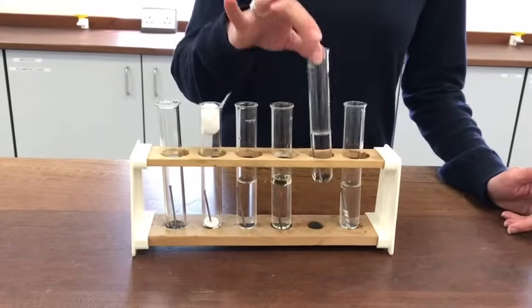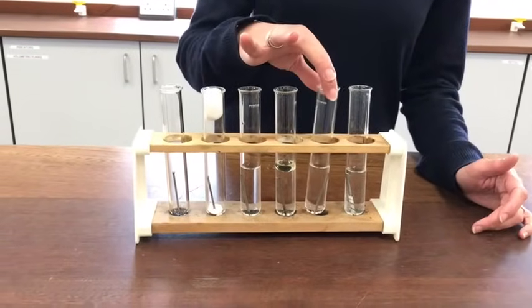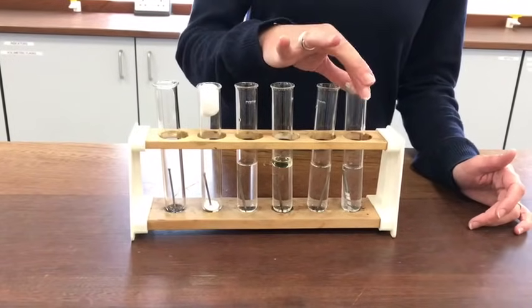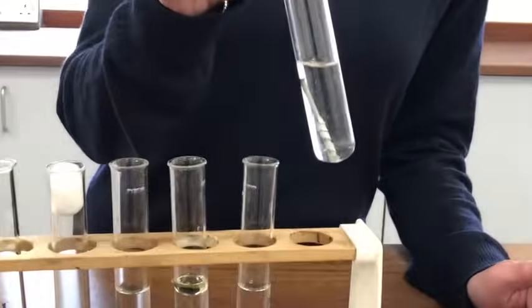Tube E here has got salt water in it, so very similar to sea water — it's quite salty. And tube F here has just got ordinary tap water again, but there's some magnesium ribbon wrapped around the iron nail.